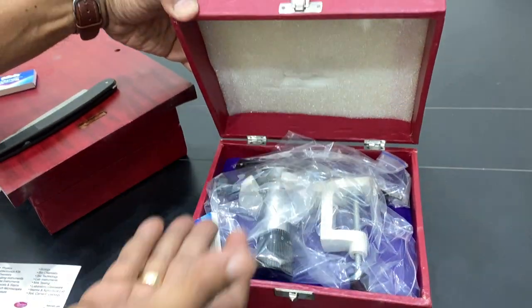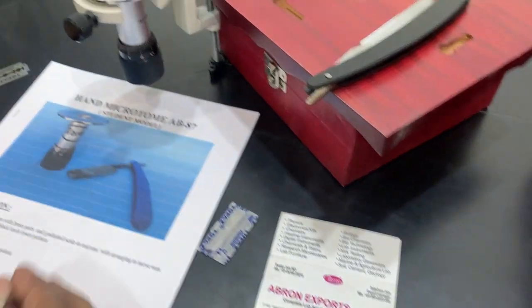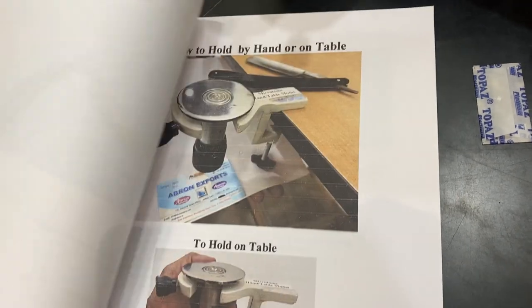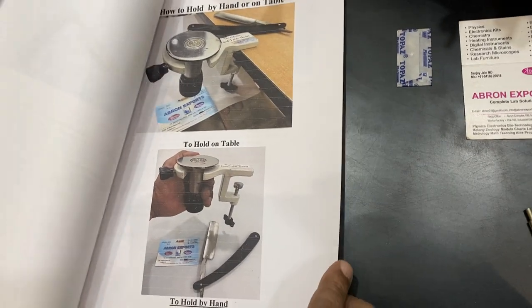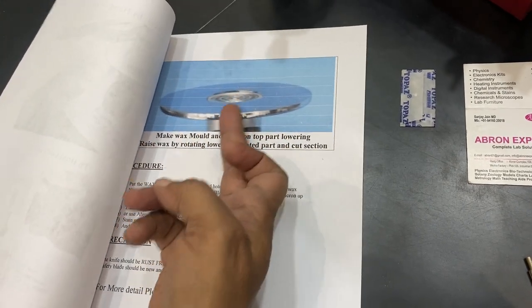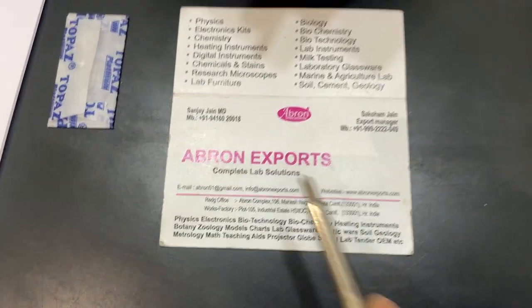Packing includes one blade, one holder, and then packing. Please visit the other websites — the manual is there showing what the different parts are, how to hold it on the table, how to hold it with the hand, and then the using procedures: block making and procedures. Very easy to use. This is the simplest microtome.